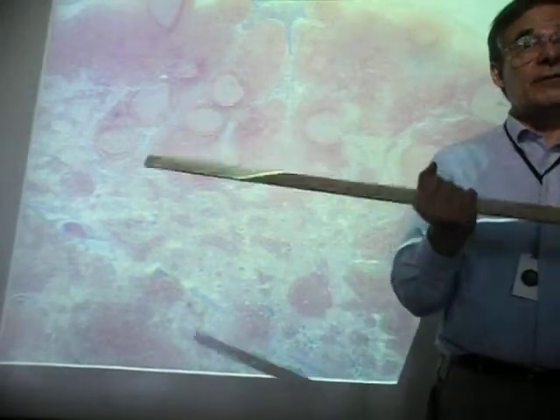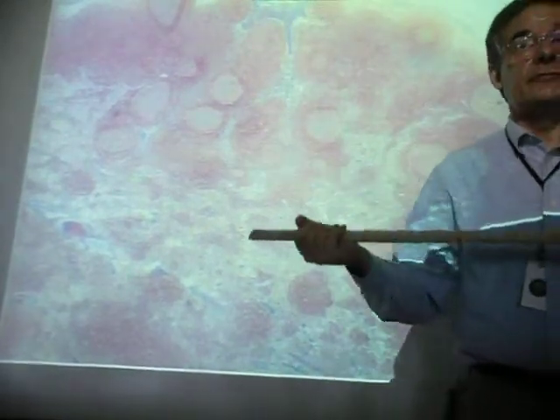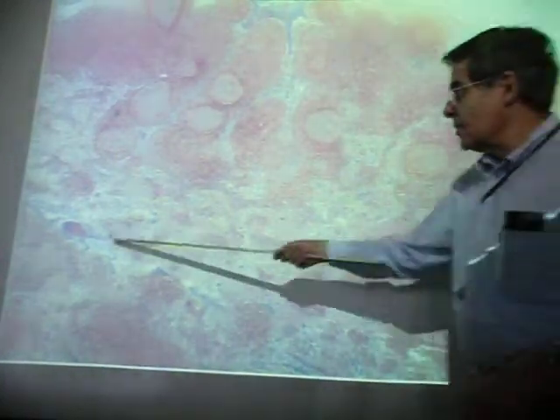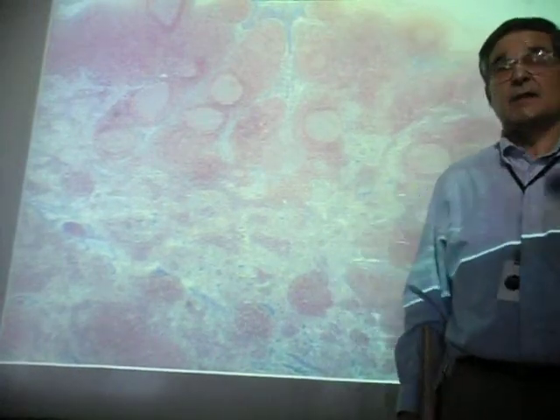And again, what's being filtered here? The lymph. Okay? By the way, these blue things here, that's part of the trabeculae, and also some of these things here are blood vessels, which I don't expect you to recognize yet, but next unit you're going to be picking out blood vessels and tissue. Any other questions?